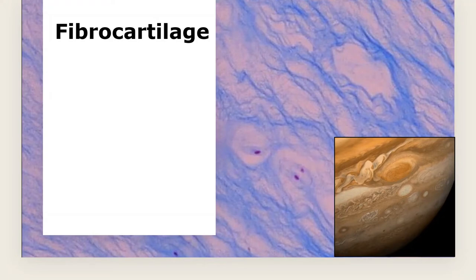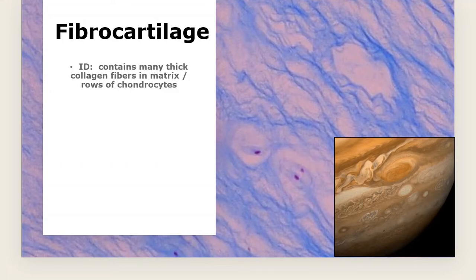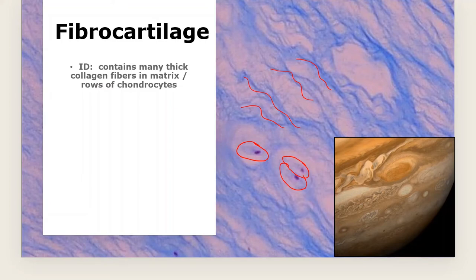Fibrocartilage is tricky — there are many different-looking pictures of it, and on exams it was the most missed type of tissue. There are many collagen fibers in the matrix and rows of chondrocytes. You can see chondrocytes in lacunae here, but most of what you see is wispy cloud or smoke-looking collagen fibers. It doesn't look like the big fat pink collagen ropes seen elsewhere — it's the wispiness that's the giveaway.